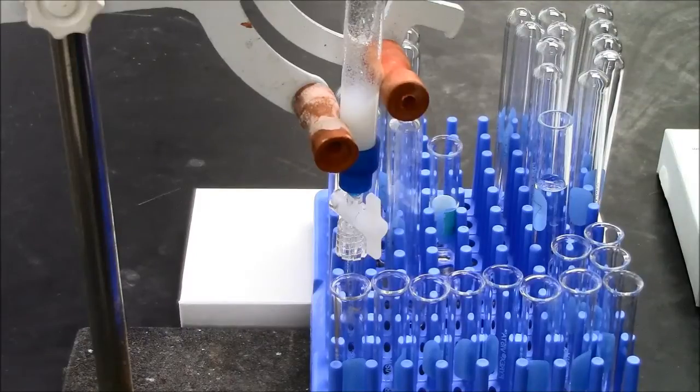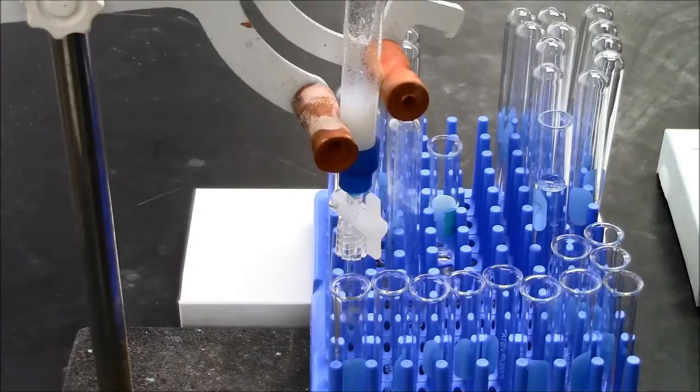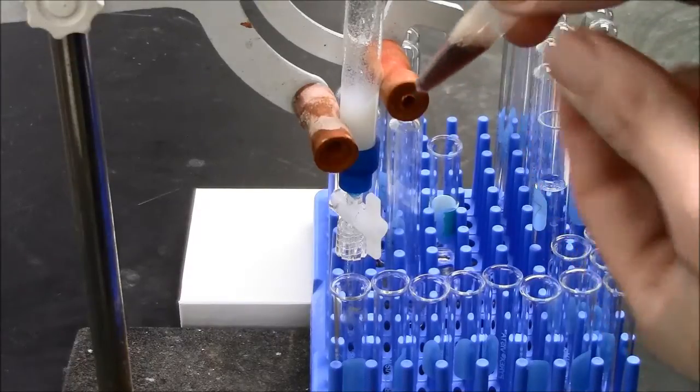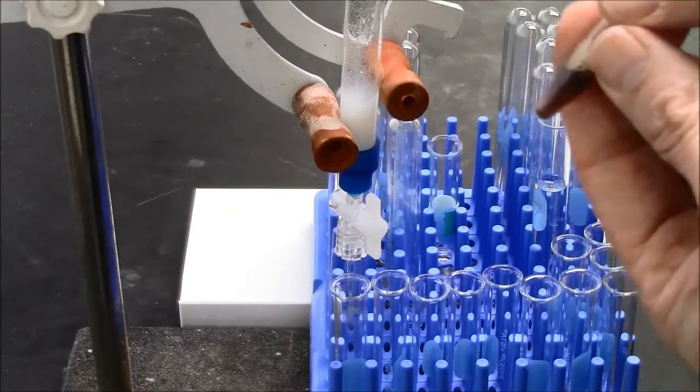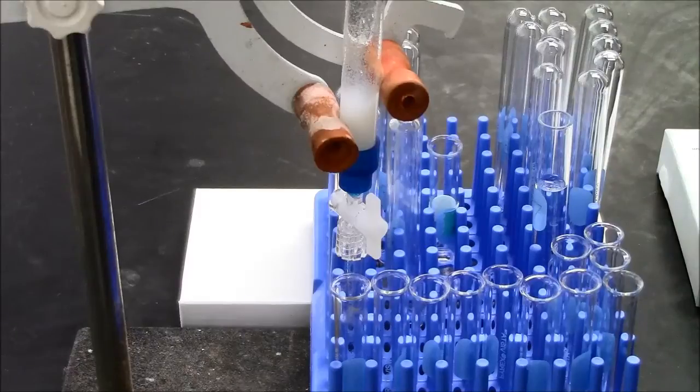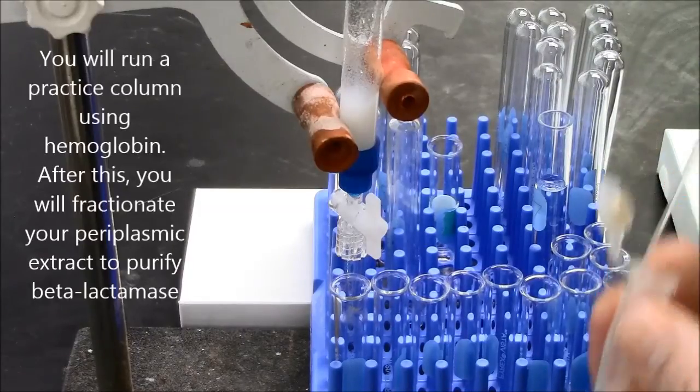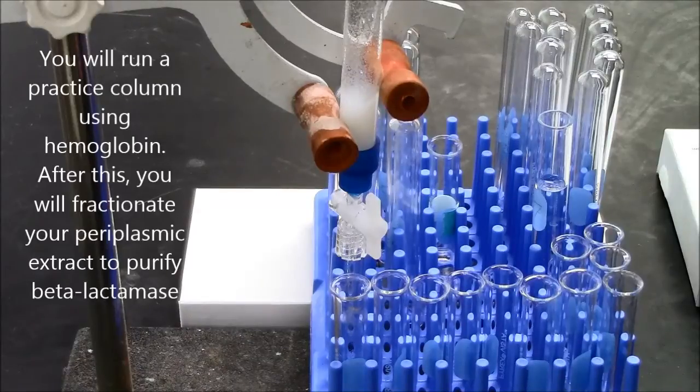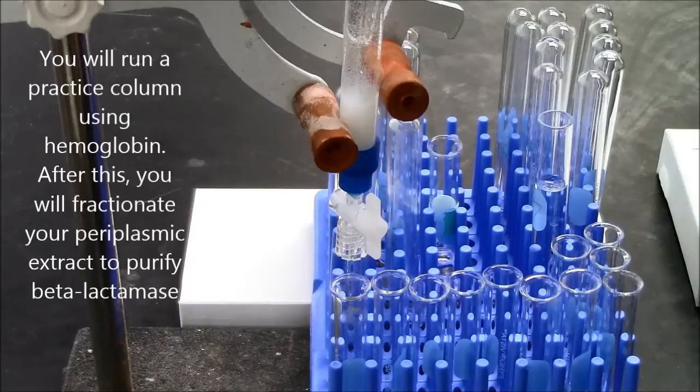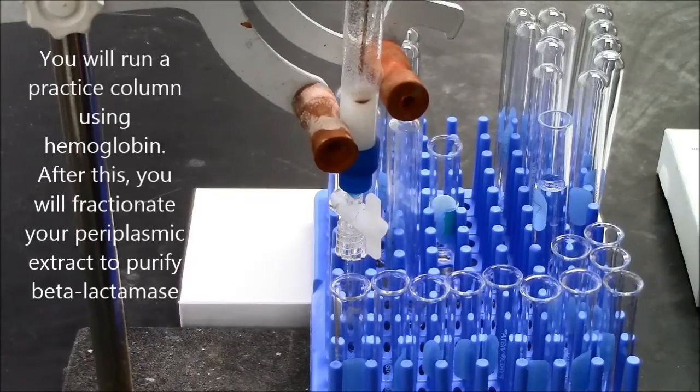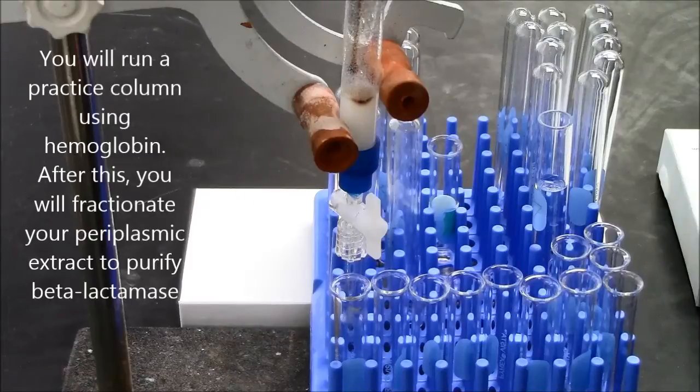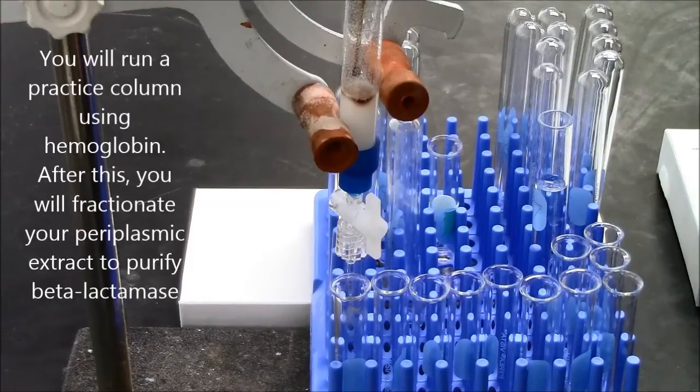I've washed it with about 20 mLs of the Tris buffer to equilibrate it. My sample, in this case, is a solution of hemoglobin, which is a red protein from blood. I'm loading about half a milliliter onto my column. So I'm using a Pasteur pipette. I want to gently drip the protein solution on top of the column, trying not to disturb the gel bed.